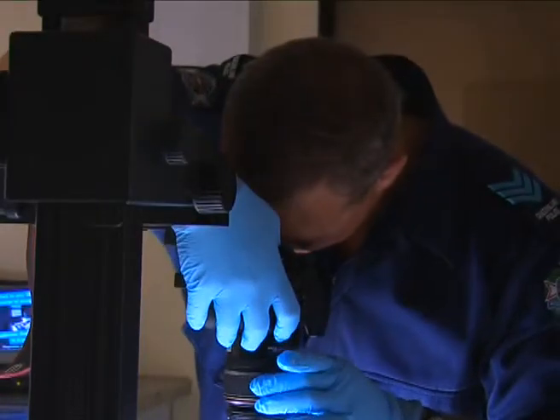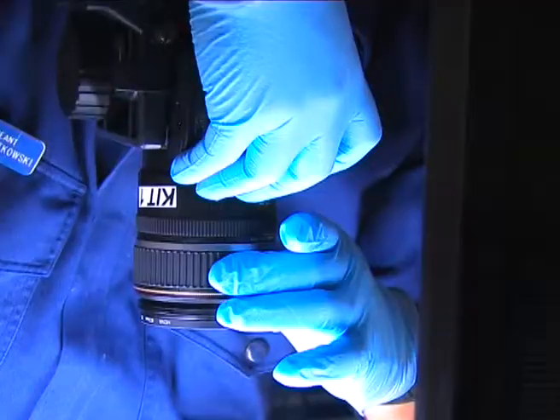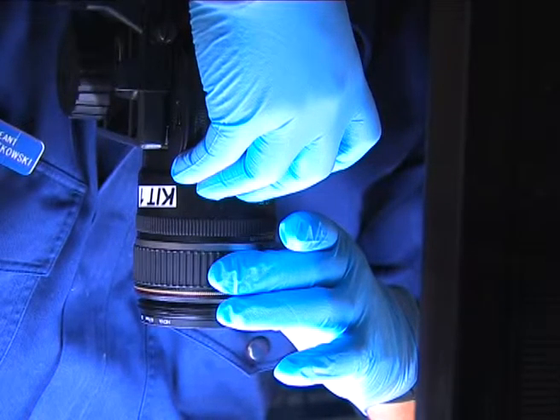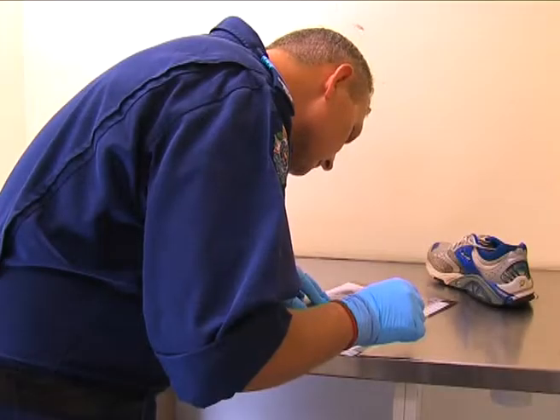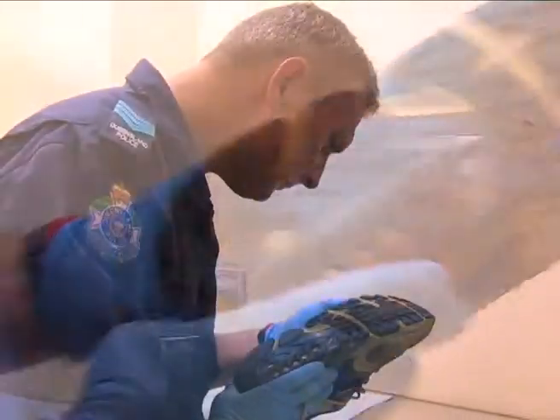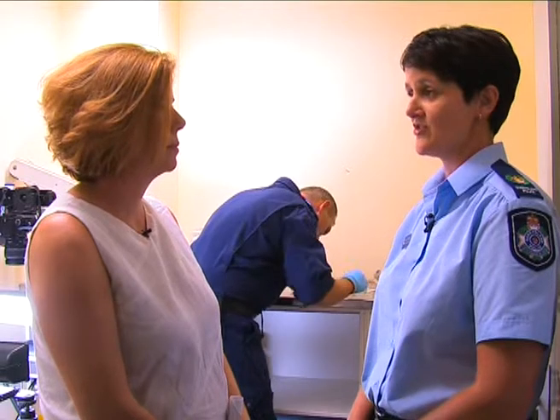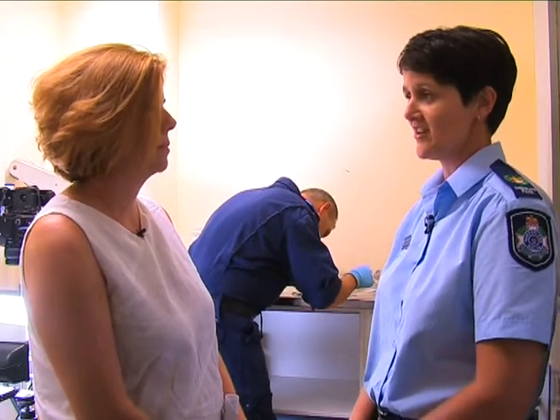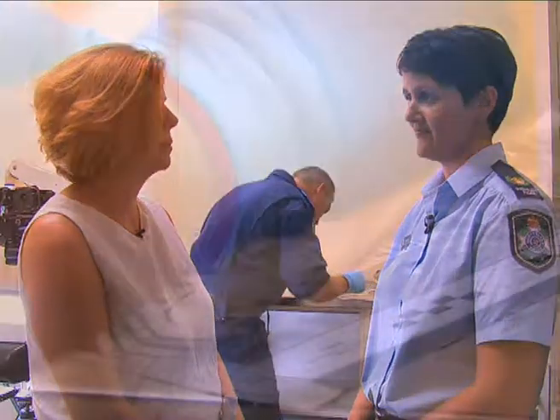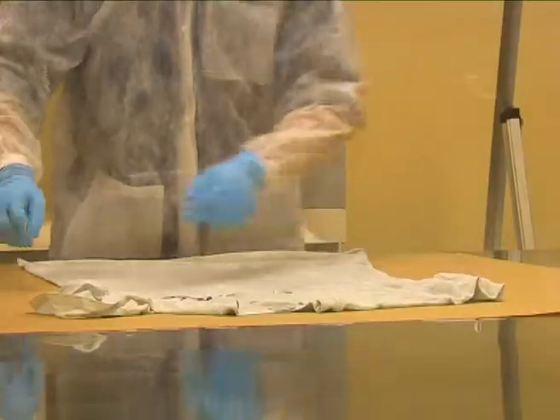So we bring the suspect's shoe in here, we take photographs of it, we make test impressions of the shoe, and then we make a comparison of that with the photographs or any moulds or gel lifts that are taken from the crime scene, see if there's any characteristics that are similar in nature, and then form an opinion as to whether that shoe may have caused that impression. The scientific officer has managed to determine that that shoe did cause that impression based on the features located within the crime scene impression. That's another match with the shoe, but what about the t-shirt that was found at the scene? This is now ready to be examined.